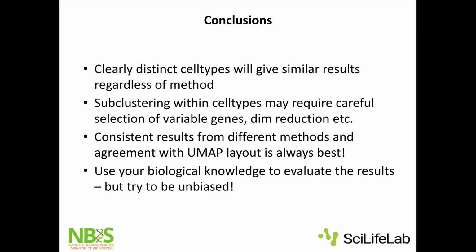I would say I always prefer an unbiased selection where we go by variable genes or something, because there's always the risk that you can force your data into something by selecting gene sets too much. But it could be the case, for instance, you have bulk RNA-seq, you have differential expression, these genes change with this treatment, and you're trying to find out what are the cell types that are changing with this treatment.